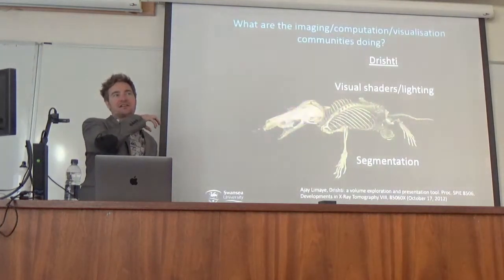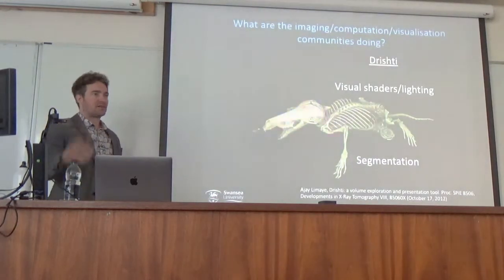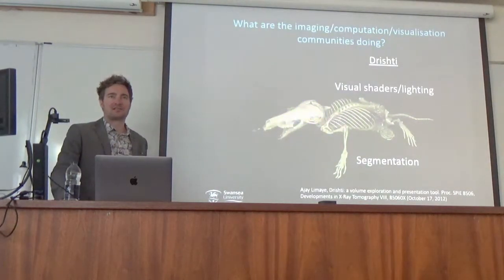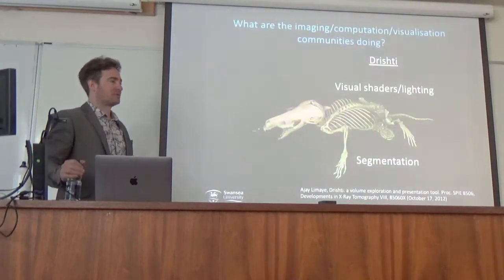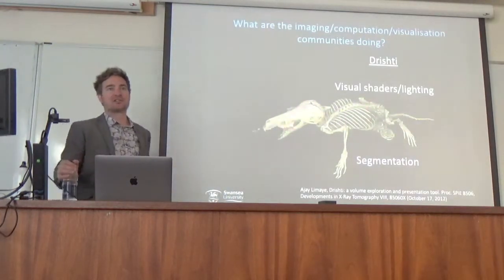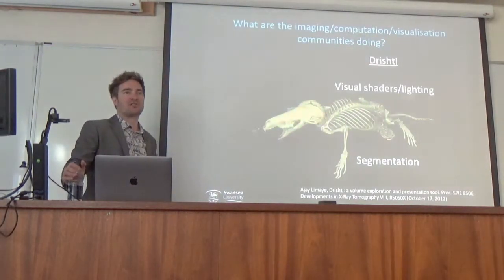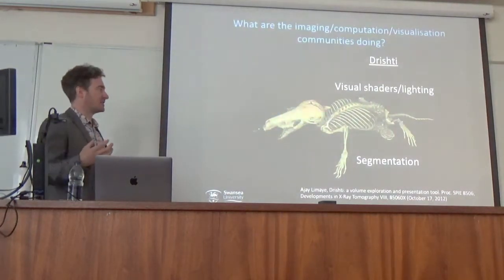And I think normally these things go by the wayside. You talk about the software that cost us 20 grand that allows us to quantify the pore volumes and do all of this characterization and quantification. They're important, but actually Drishti has probably led to more collaborations and working with different people, because people are just drawn to the images and the visualizations.